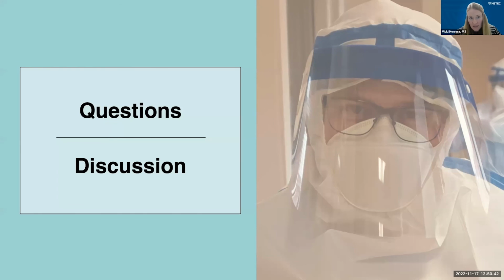I just want to add to that too. With slides, you are dealing with sharps. The slides are sharp. So if you are looking at a PUI, make sure that you evaluate the appropriate PPE. If you have the option to do those slides in a biosafety cabinet, that's going to add a layer of protection for you.